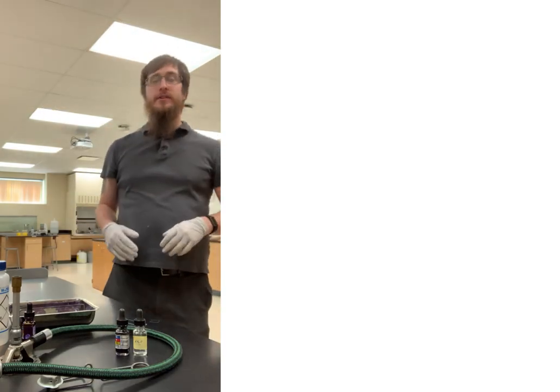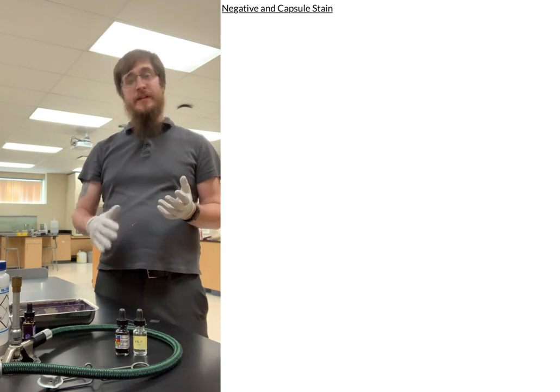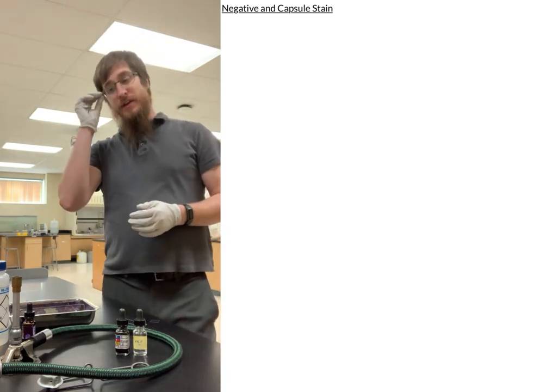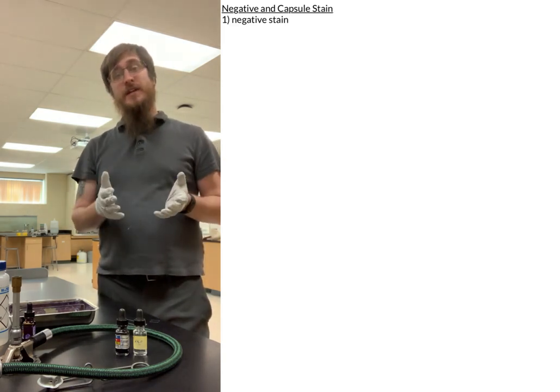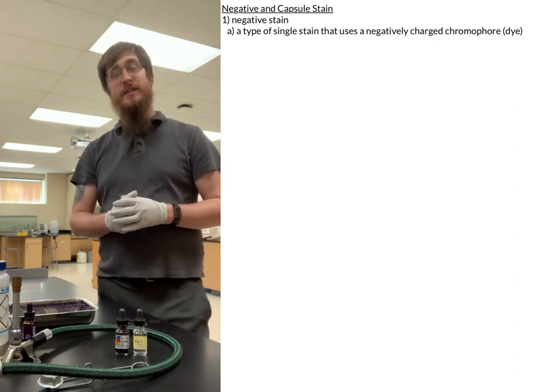Hey everybody! Today we're going to be talking about the negative stain and the capsule stain that we're going to be doing in class. And again, when it comes to a negative stain, the negative stain is a type of simple stain, or a stain that only utilizes one stain.